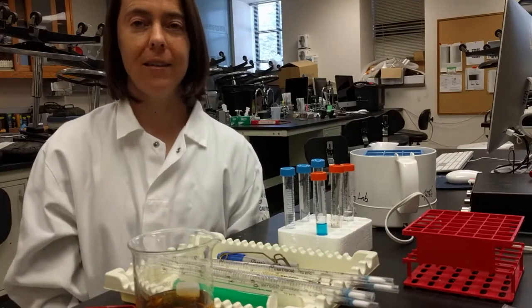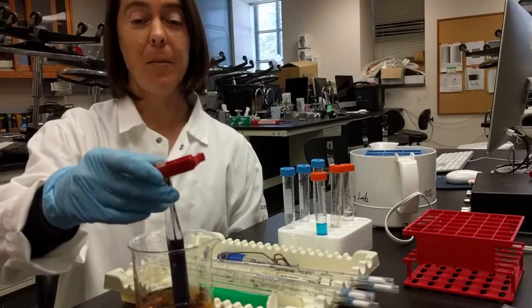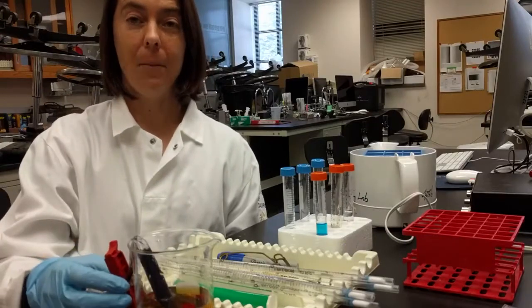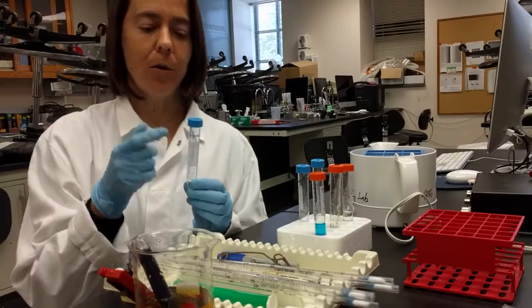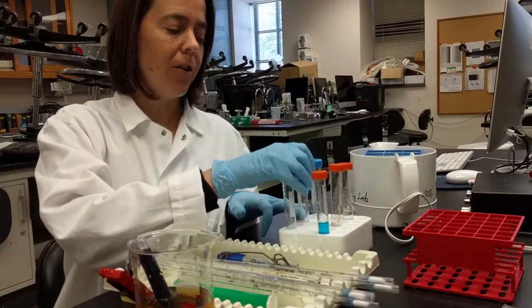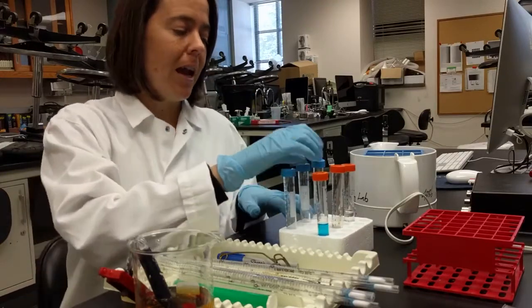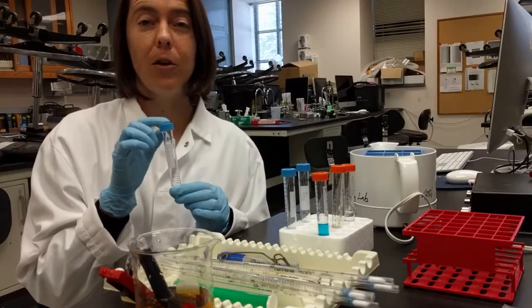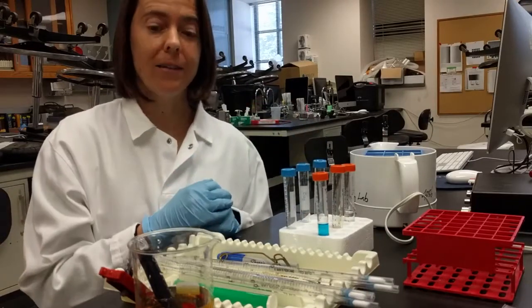Now we need to do a test to see what happened to the glucose. Is the glucose still in the bag, or did some of it come out? And so we're gonna run a Benedict's test, and I have 3 tubes here. So one is labeled beaker. I'm gonna put some beaker solution in there. And another is labeled bag, and so I'm gonna put solution from the bag into this one. And then the one labeled control, I'm just gonna put water into there. Okay, so let's go ahead and do that.